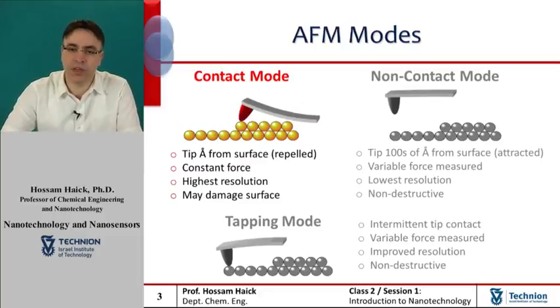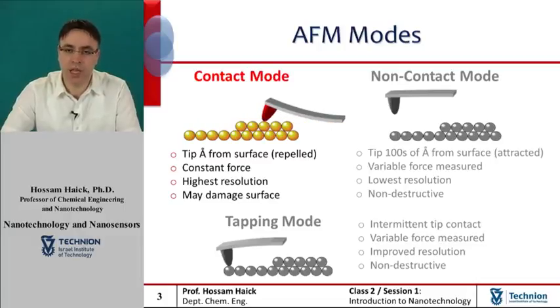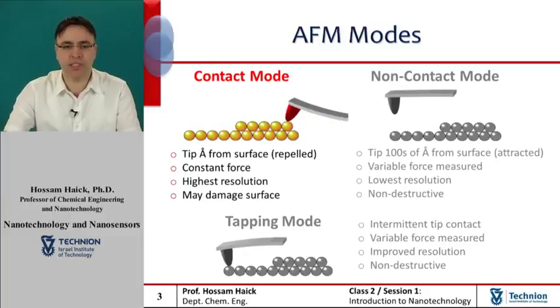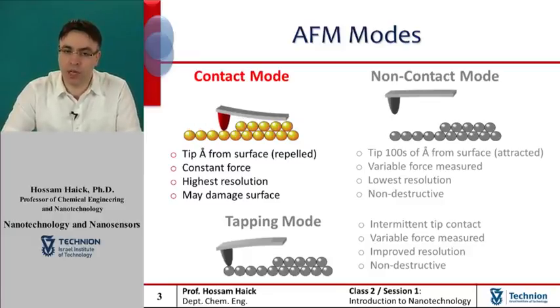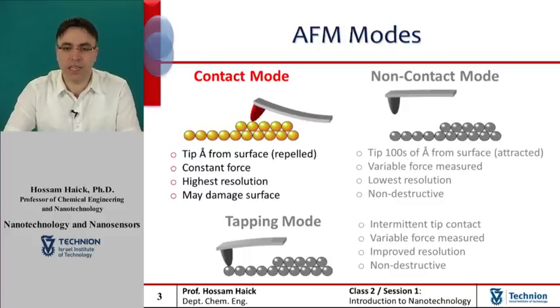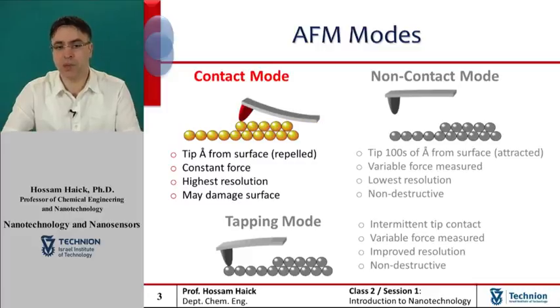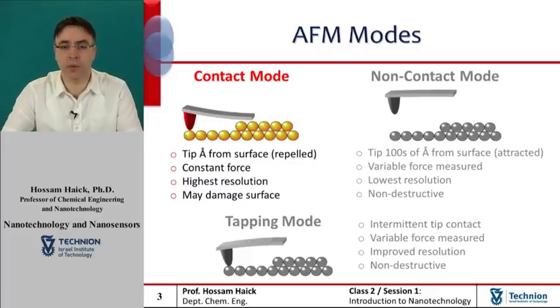In the static mode operation, the static tip deflection is used as a feedback signal. Because the measurement of the static signal is prone to noise and drift, low stiffness cantilevers are used to boost the deflection signal. However, close to the surface of the sample, attractive forces can be quite strong, causing the tip to snap into the surface. Thus, static mode AFM is almost always done in contact, where the overall force is repulsive. Consequently, this technique is typically called contact mode.